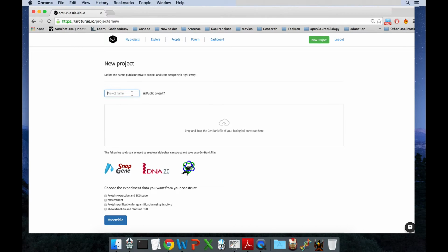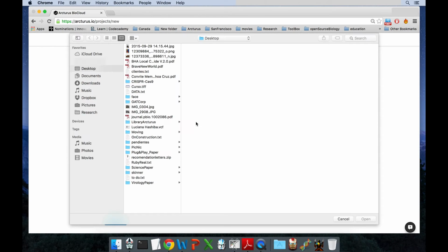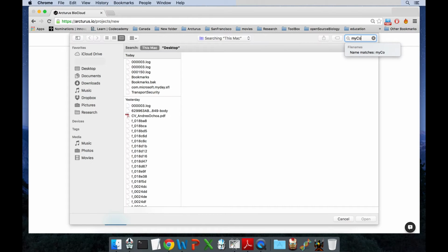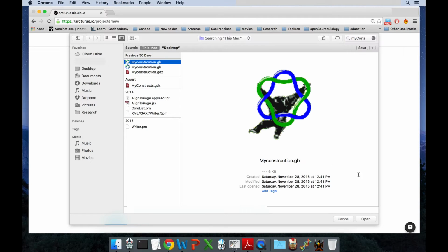You can name your project. Let's name it My Construction. You can choose if you want to be a public project so everybody can see it, or you want it to be a private project. And then you're gonna look for your file. Let's look for it, My Construction. Here it is. So I will open it with the platform.